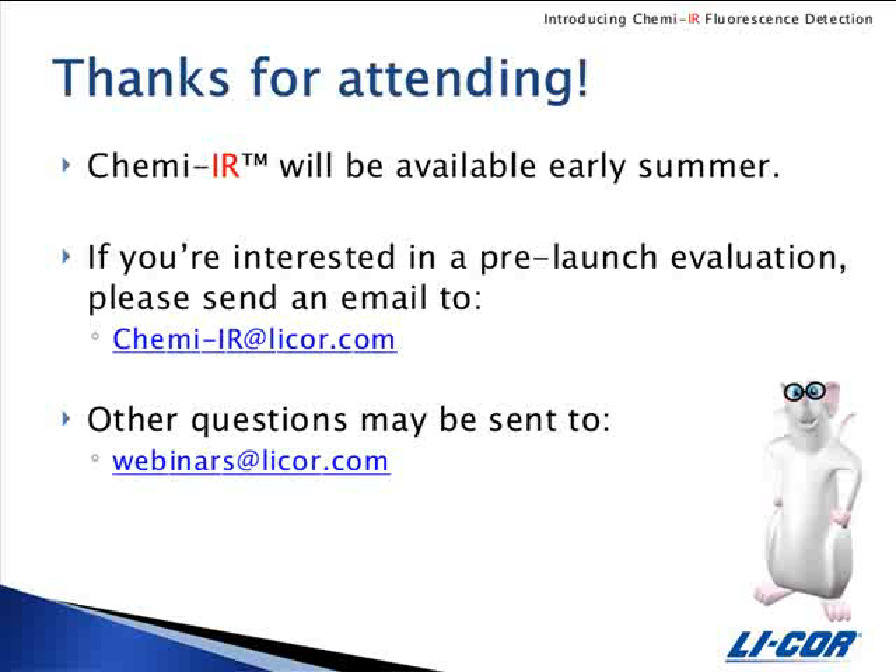Our next participant asks: why can't I use Odyssey blocking buffer before chemiluminescent detection? Odyssey blocking buffer contains sodium azide, which inhibits the chemiluminescent reaction. So if you are interested in performing the chemiluminescent reaction, you'll need to use your normal blocking buffers such as skim milk or casein so that it won't inhibit the reaction. If you don't want to do the chemiluminescent portion of the detection, you can use Odyssey blocking buffer up to the chemiluminescent detection step.